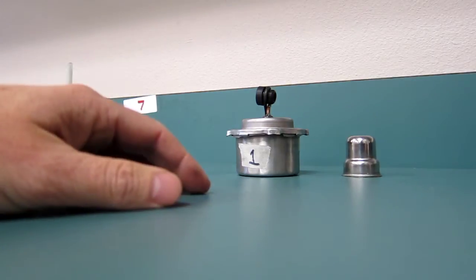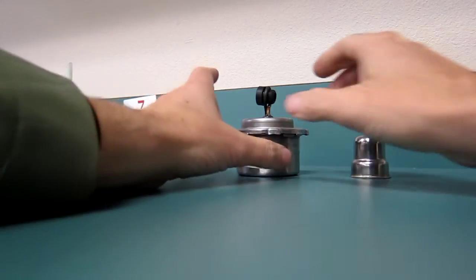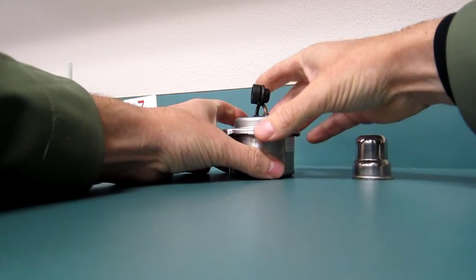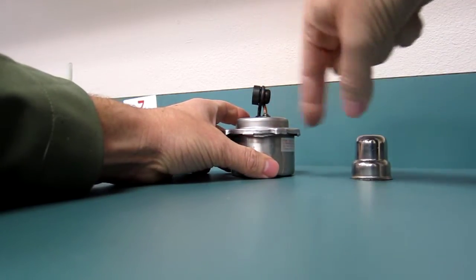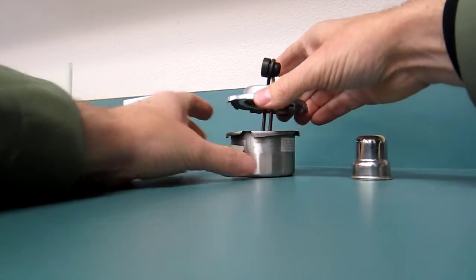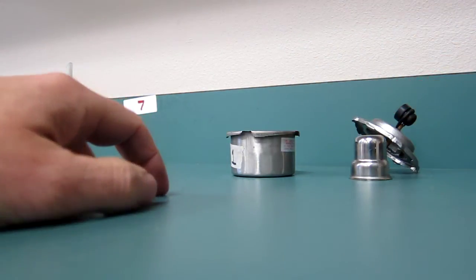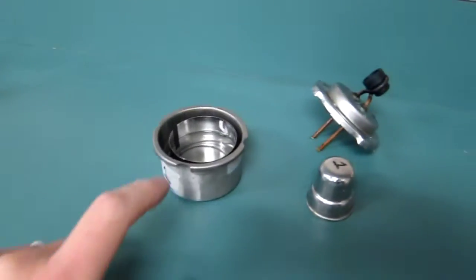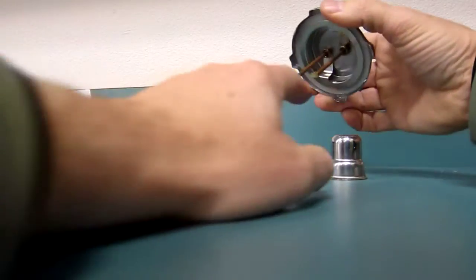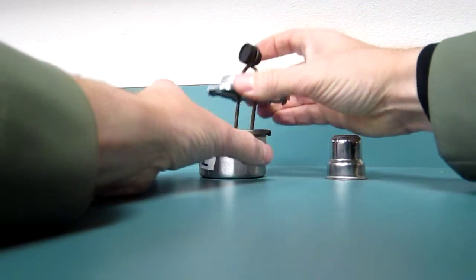You may not transport the alcohol burners with the lids off. So once the lid's open, you just twist it counterclockwise, a half a twist or a quarter of a twist, and it will lift right out of these grooves right here. And inside of here is, of course, alcohol. Might be hard to see in the camera. That alcohol goes up this and travels into the little spot right here where it's burned.